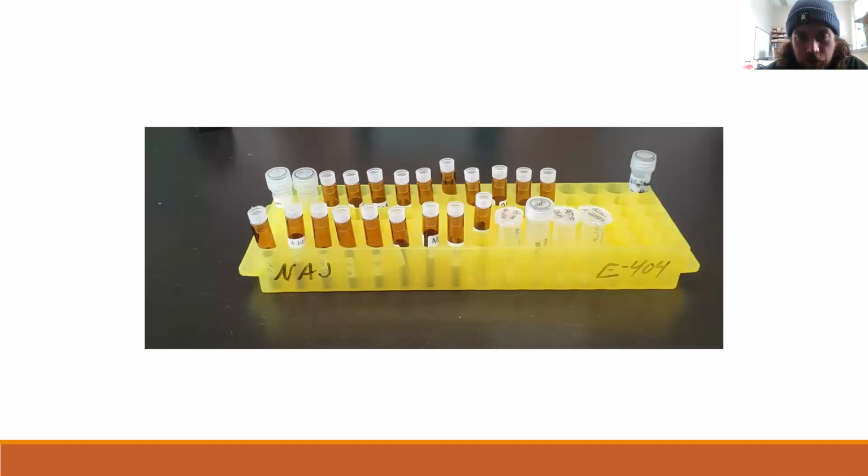So this is just what my setup looks like. Basically, these are the peptides that I organize, and these are my stock concentrations. Then I dilute these into the final volume of my plate. You would want to organize your stocks in a way that allows you to easily go through each peptide, because you have to put the specific peptide or drug you're using in each well and just keep it organized.